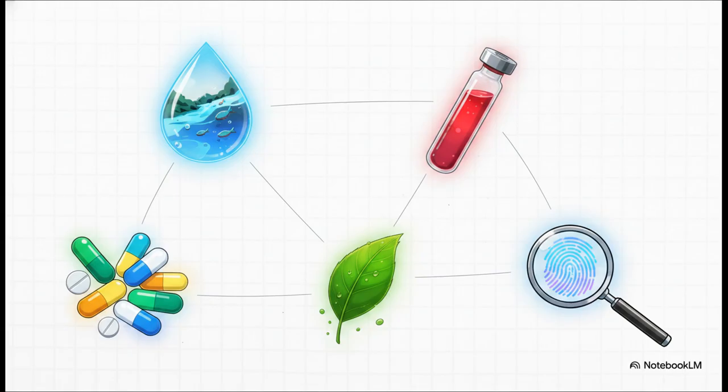It's also everywhere in clinical settings for testing blood and urine, out in agriculture verifying the safety of our food supply, and in forensic labs where figuring out the exact elemental profile of a tiny soil sample can literally place a suspect right at the scene of a crime.